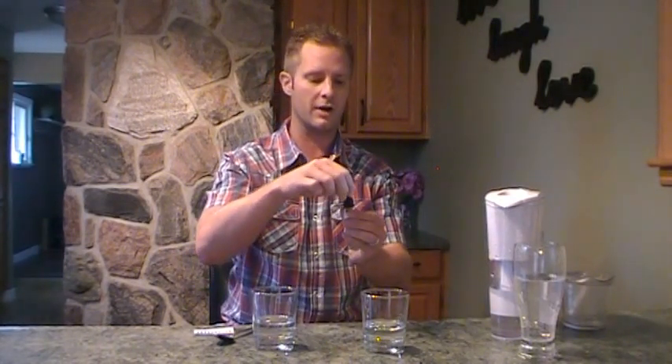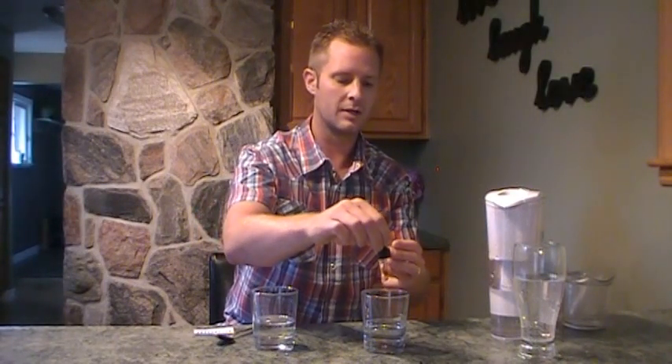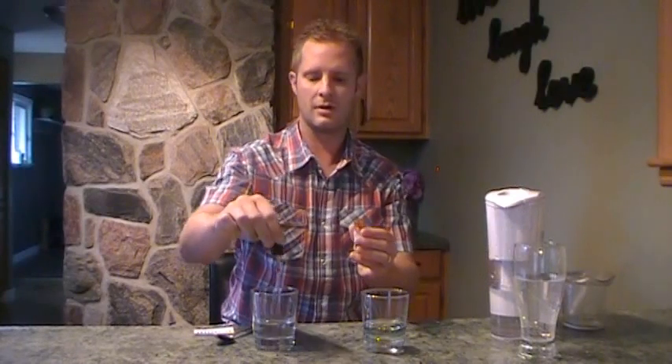I'm just going to set that out of the way, and we're going to put two drops in each. So we've got tap water, alkaline water, and we're going to put two drops in of each — so one, two, one, two.